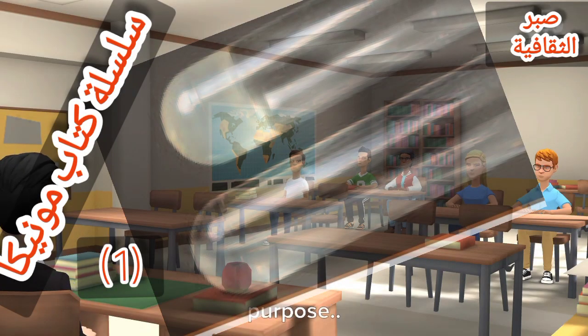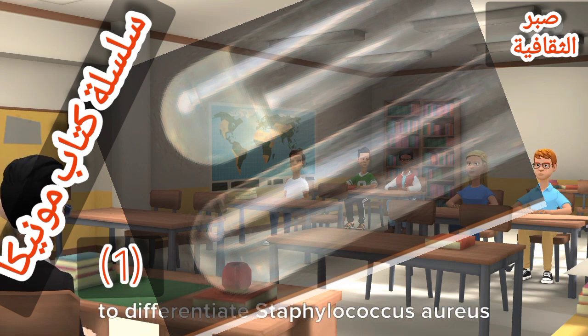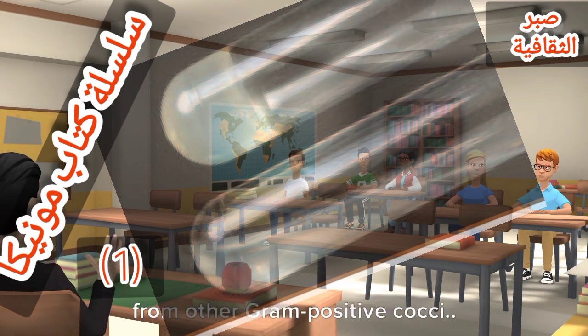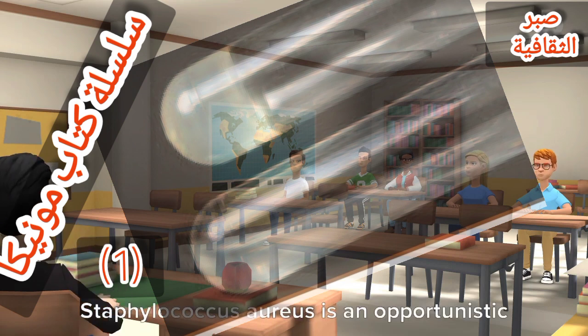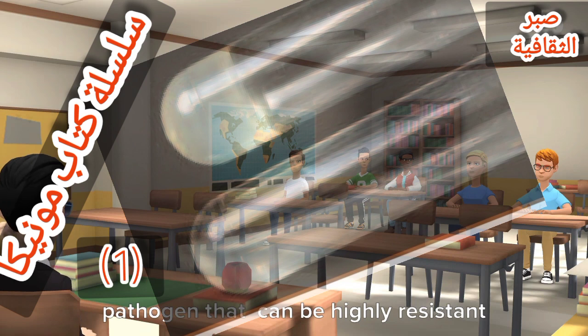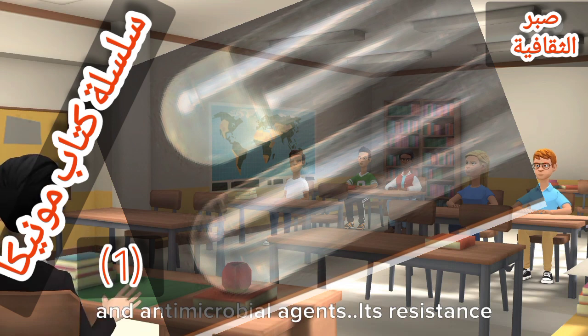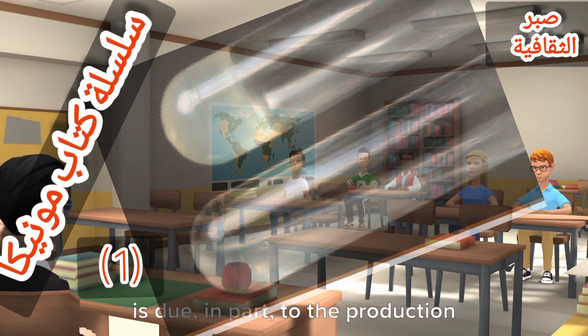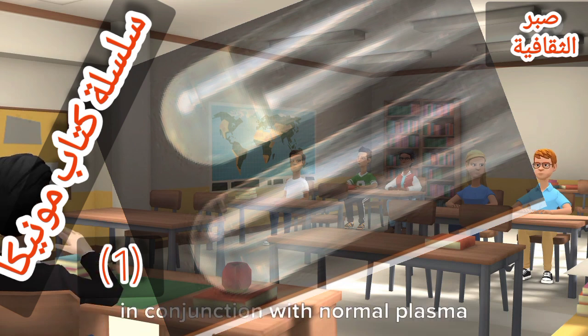Coagulase test. Purpose. The coagulase test is typically used to differentiate Staphylococcus aureus from other gram-positive cocci. Principle. Staphylococcus aureus is an opportunistic pathogen that can be highly resistant to both the normal immune response and antimicrobial agents. Its resistance is due, in part, to the production of a coagulase enzyme.